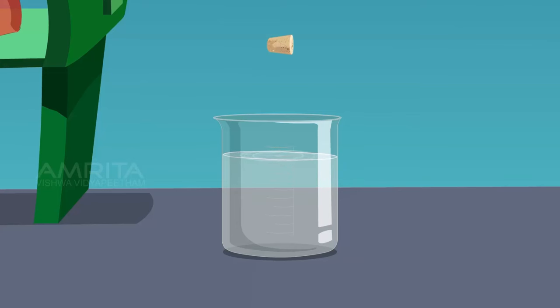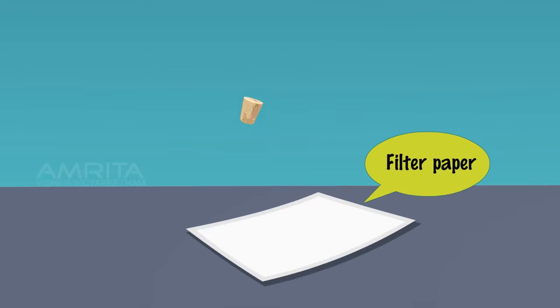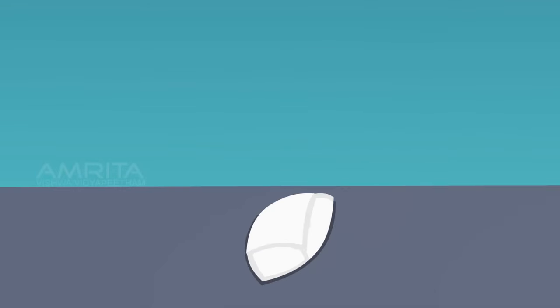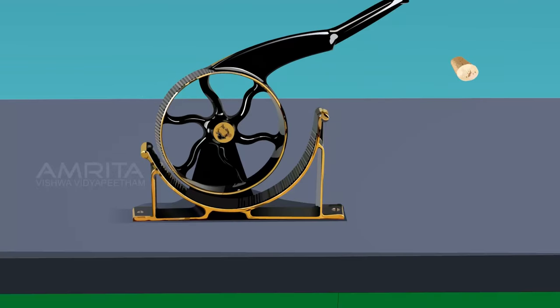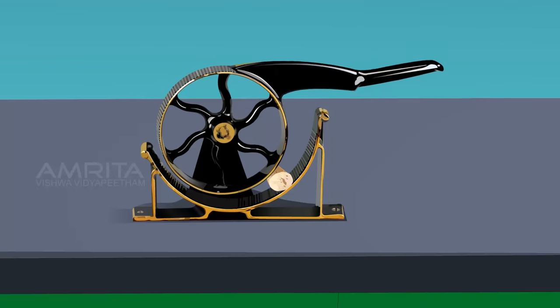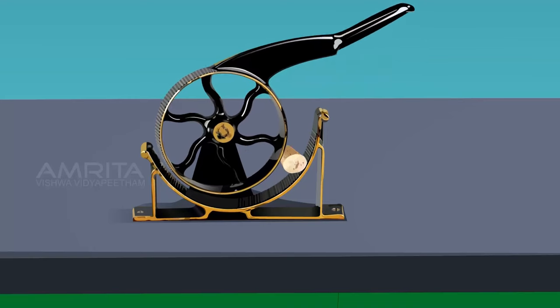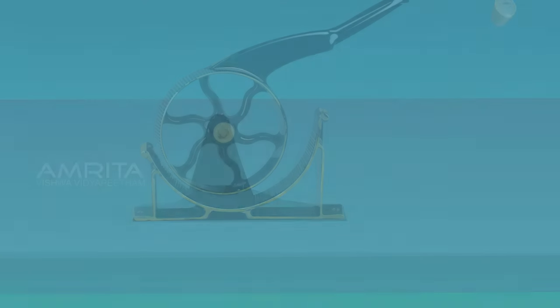Take the cork from water and wrap it in a filter paper. Place the wetted cork in a cork presser and press it to soften it. Thus, the cork is softened.